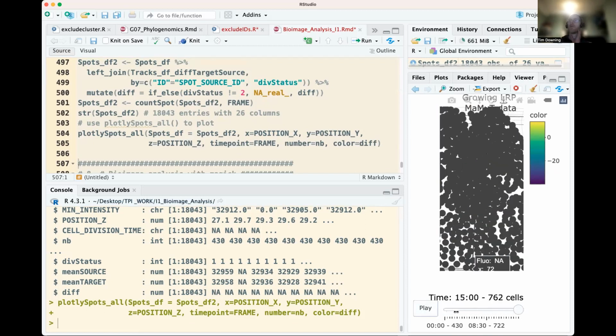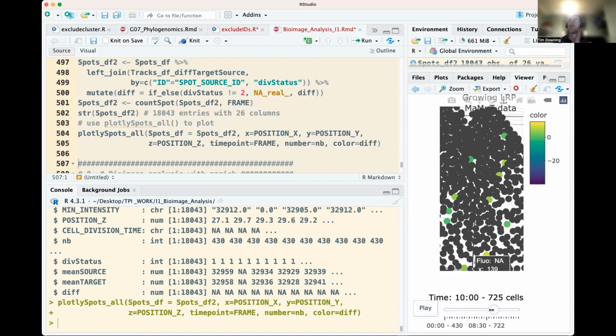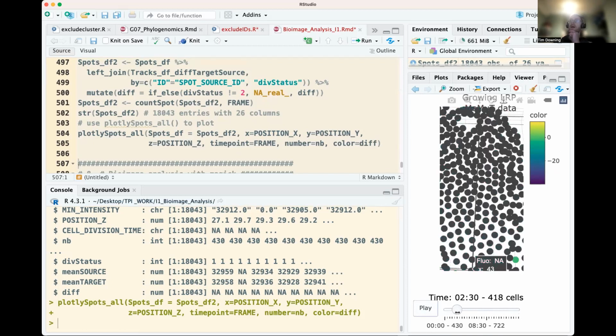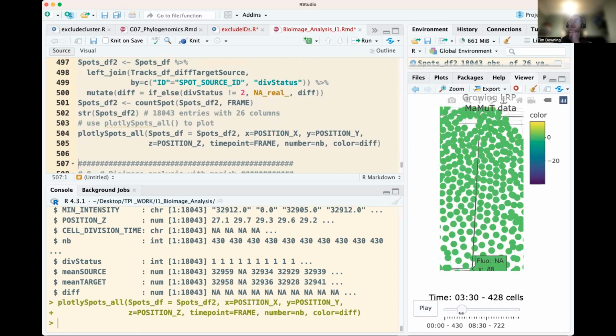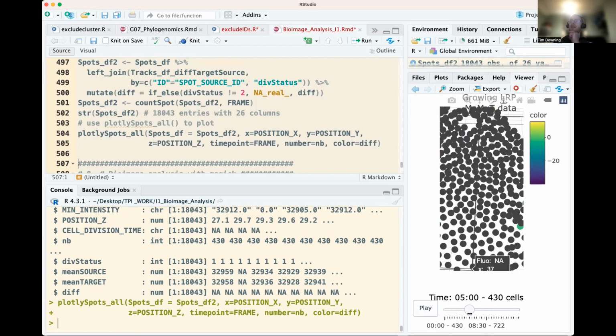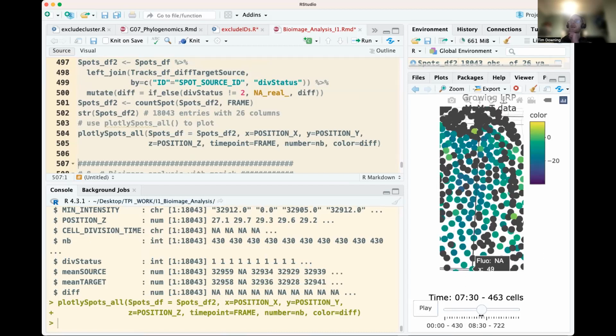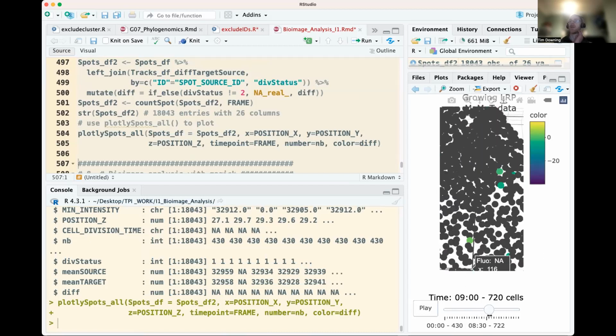We can see that there are different key points where there are differences in changes in intensity. Here at 130, there's a big difference where they all change slightly, and then that decreases. Then again at 3 minutes, you get it again, and then at 5:30, we get it again. And then a slight one at 7:30, but that's it.